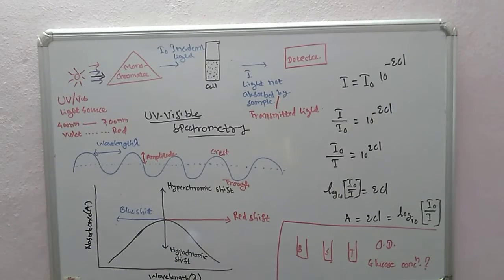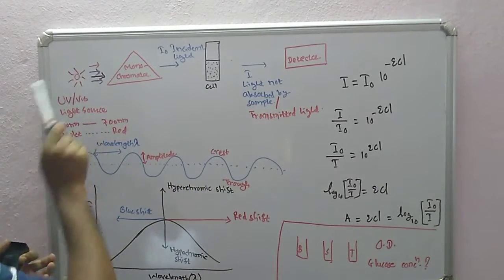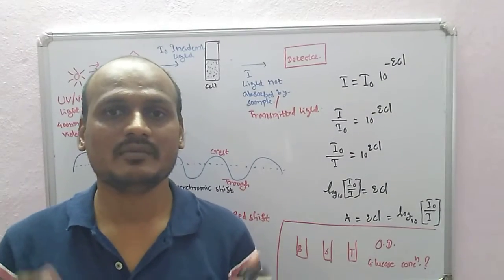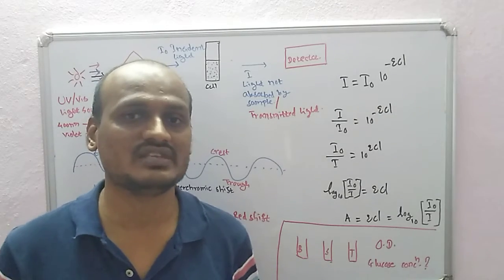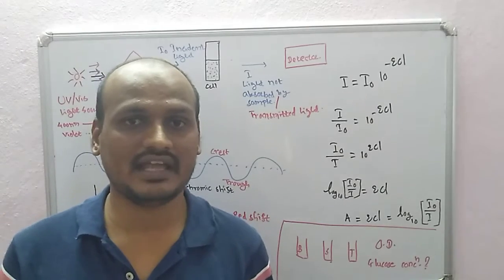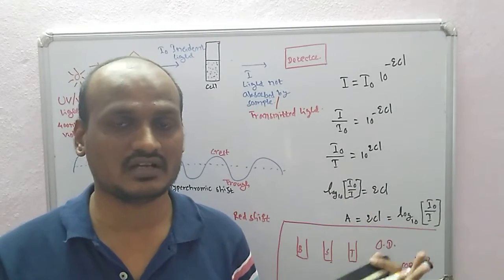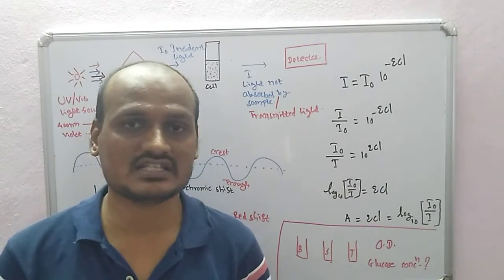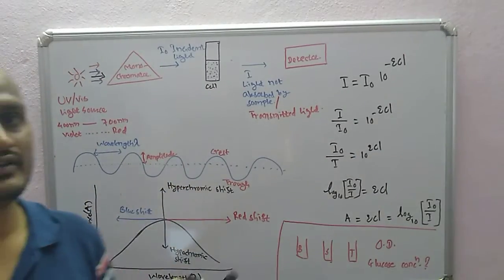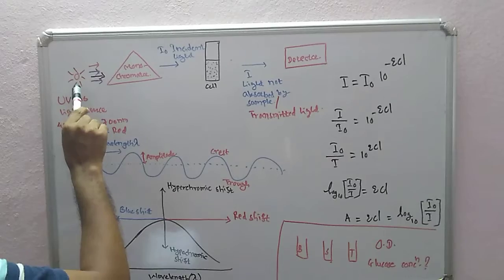So we are going to depict it here. UV visible spectrophotometry, right? We have this light source here. This is a polychromatic light. Polychromatic light means that the light is made up of multiple colors. So when we see white light, this white light can be divided into 7 colors, like our rainbow colors. Whenever there are clouds and sunlight passes through them, it gets split into the 7 colors. Likewise, we want to split our light into a particular color, and a particular color has a particular wavelength.